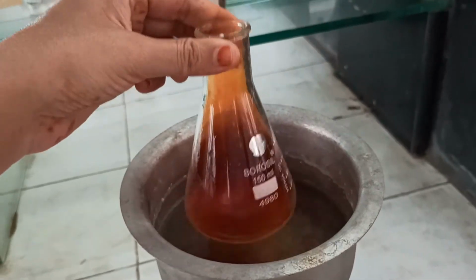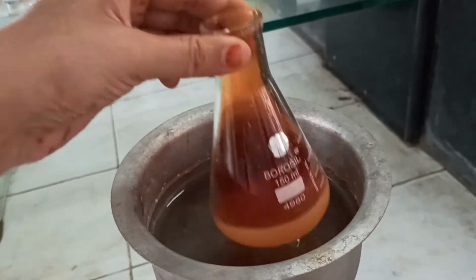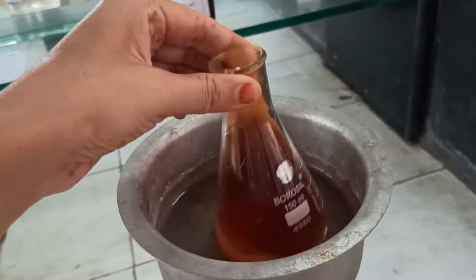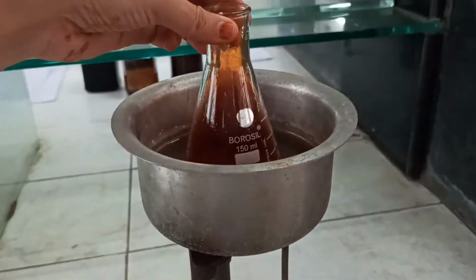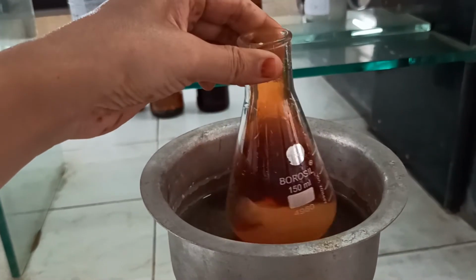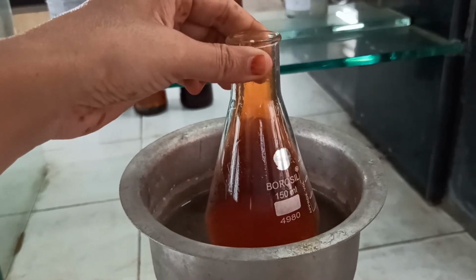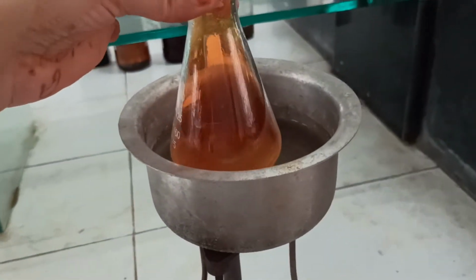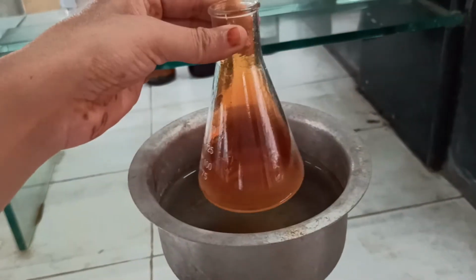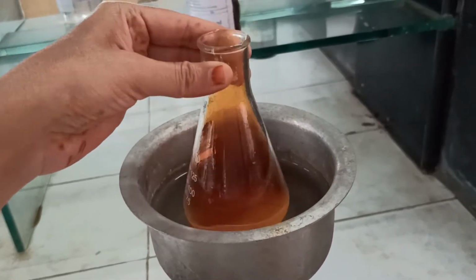Students, now you will see the change in the reaction mixture after about 15 minutes. Students, see the reaction mixture after about half an hour of heating.